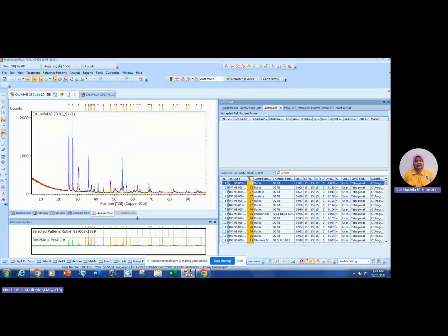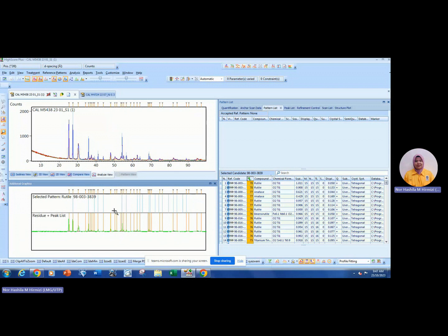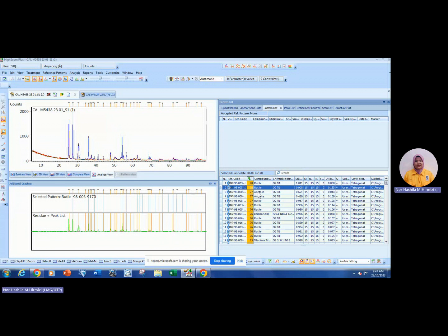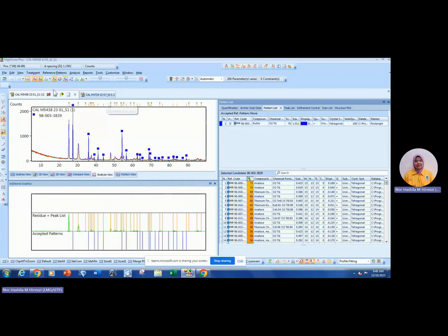The first candidate is Rutile. You can monitor from here — this is the selected pattern (Rutile) and this is your sample. For Rutile, it shows that more than 10 peaks are actually matching. Scroll down to the bottom to see whether it matches with others as well. If you feel that Rutile is acceptable with your pattern, drag it up — it will be assigned as Rutile. Counting the peaks: 11 peaks belong to Rutile.